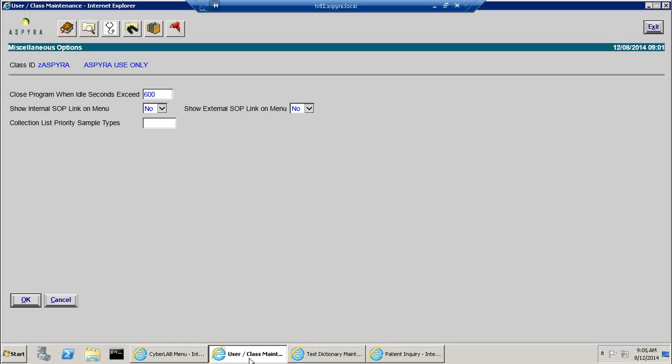You can set up a quick launch icon to go after it. So if you have manuals or procedures and so on in that area, you can see that. So there's not much reason for it, but because the program still exists, the menu items are here.